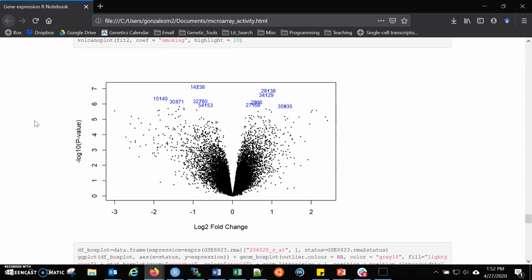And for the rest of this week, we're going to move into the cutting edge of RNA-seq, which is this idea of single cell RNA-seq. Instead of looking by sample, we now have the technology to look at the gene expression in one particular cell, and we could do that in thousands of cells at a time, which we're going to see in the next activity, also using R.